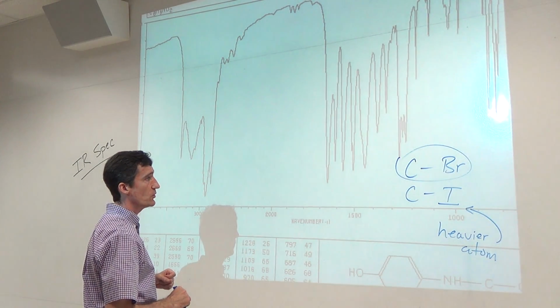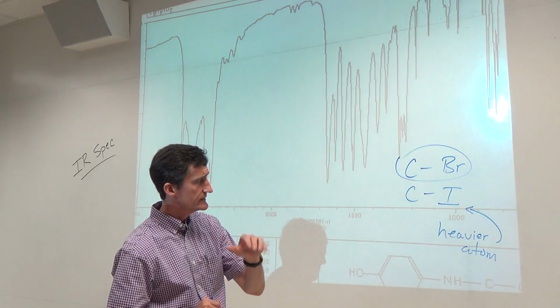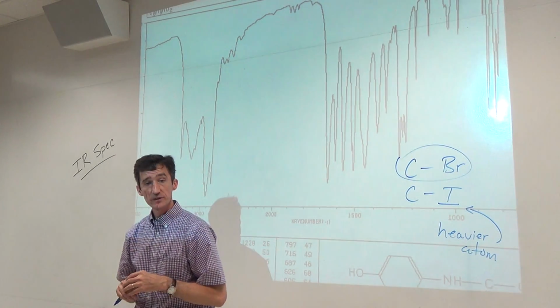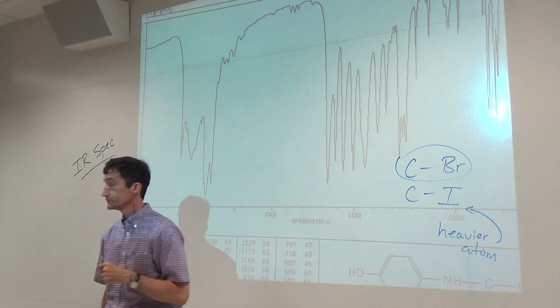We can also, well, at this point, let's move to our first table of where particular bonds absorb. That's one of the next, I believe it's at the bottom of the page with Hooke's law.